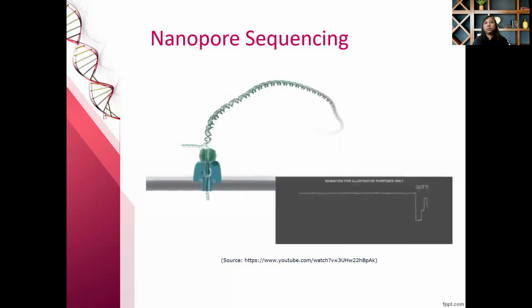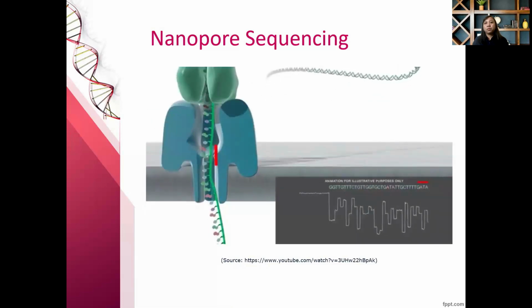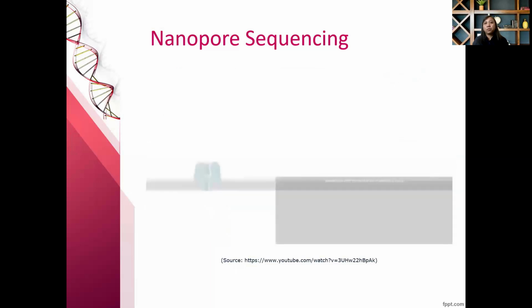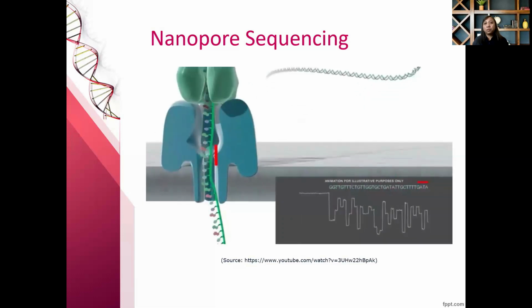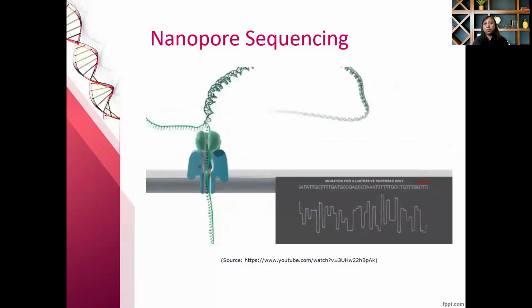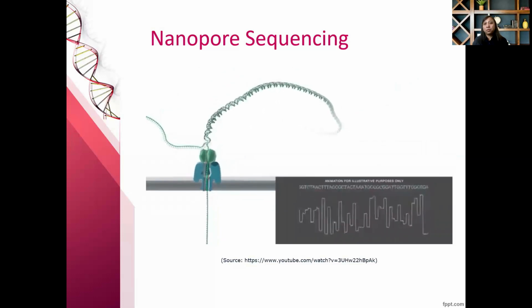In strand sequencing, an intact DNA polymer is sequenced as it passes through the nanopore. Here you see a DNA enzyme complex approaching the nanopore, shown in blue. The enzyme, shown in green, is designed to ratchet the DNA strand through the nanopore one base at a time. The enzyme binds to the end of a double strand of DNA and unzips the double strand to form a long single strand, which it feeds through the nanopore.